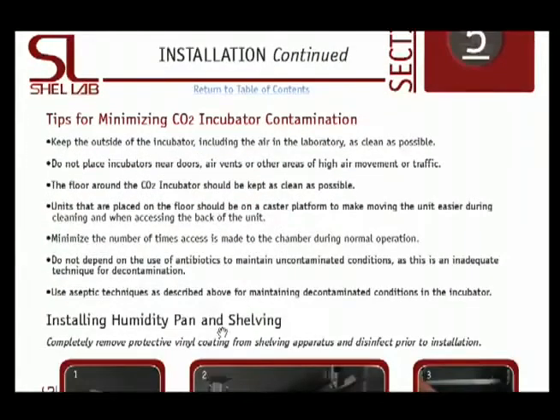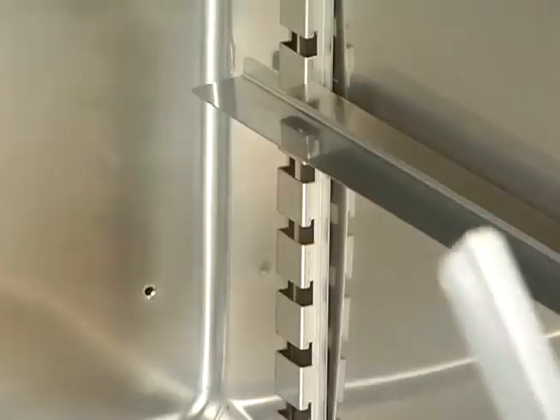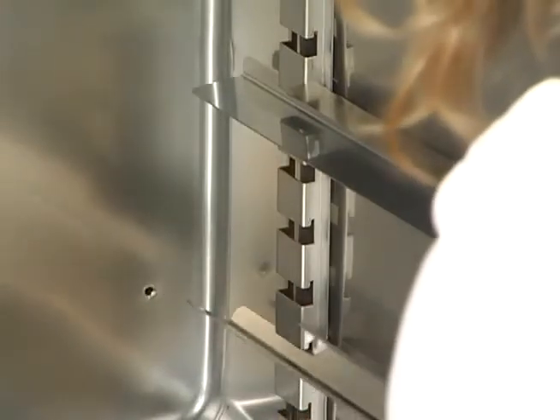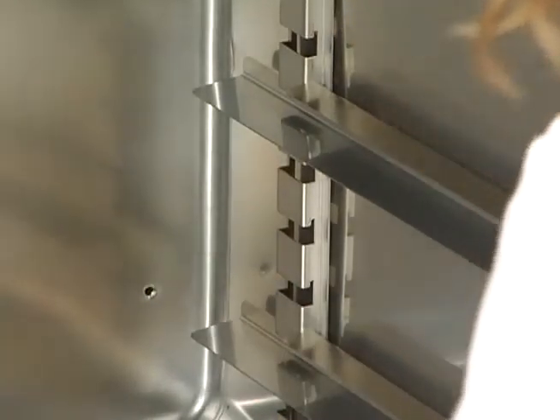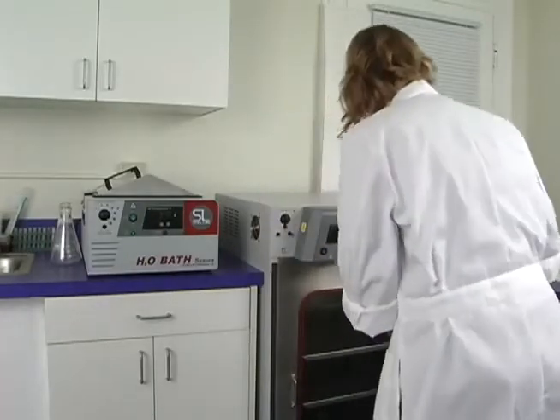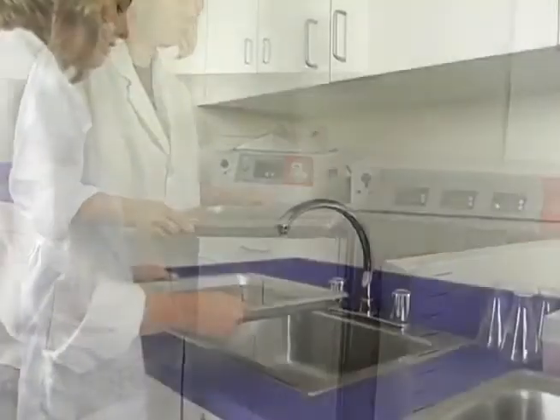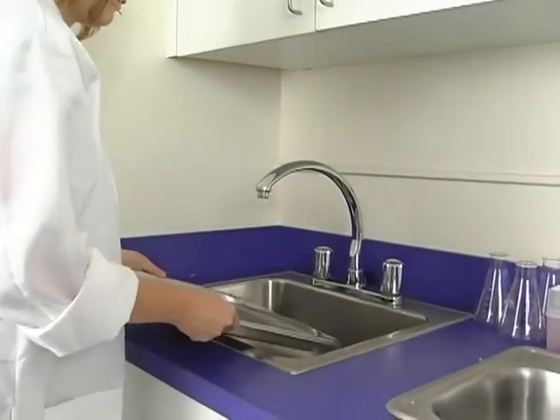Once your 3552 has been properly cleaned and installed in your laboratory, the decontamination cycle is activated with a few simple steps. First, be sure all of your samples and supplies have been removed from the incubator chamber. Next, remove any excess water from the humidity tray located at the bottom of the chamber.